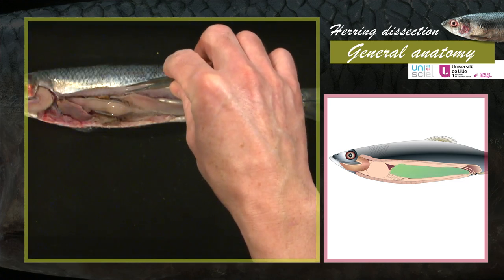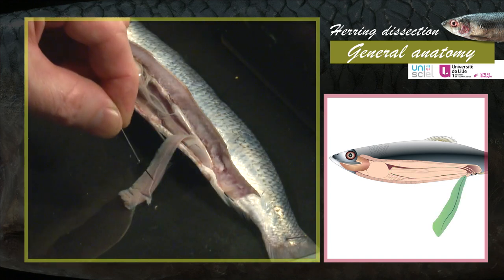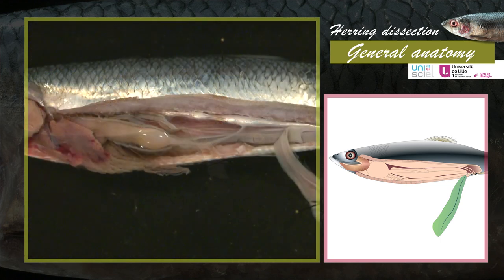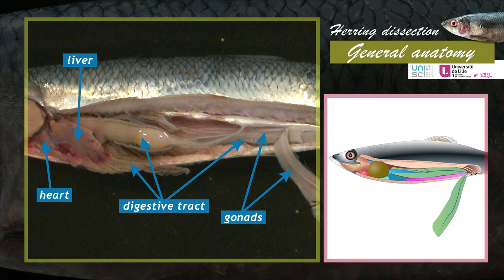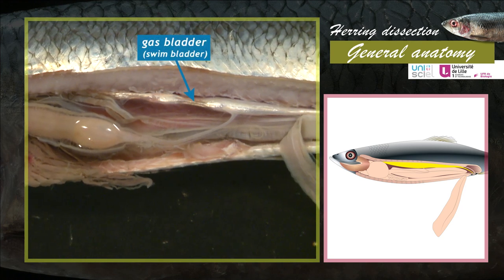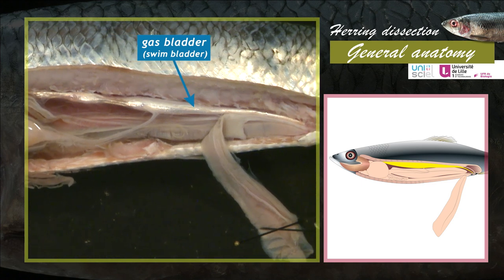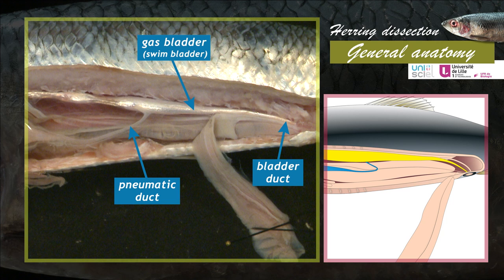To see the organs located in the abdominal cavity, lift the left gonad up, cut the blood vessels located in the anterior part, fold the gonad back and pin it, keeping in place the canal that links it to the anal and urogenital papilla. The following structures are now visible: the heart, the gonads, the liver, the digestive tract, and the gas bladder. The gas bladder, or swim bladder, is a silver-coloured organ located in the dorsal part of the abdominal cavity. Its main role is hydrostatic — the air inside serves to maintain neutral buoyancy. The swim bladder is connected to the stomach via a canal, the pneumatic duct. A second bladder duct enables the evacuation of gas through the anal and urogenital papilla.